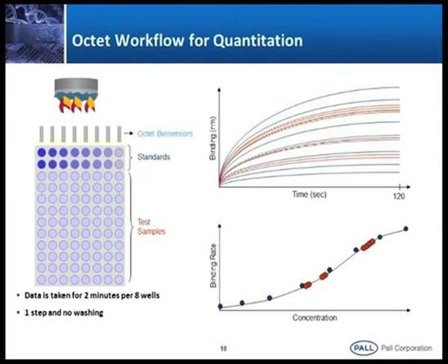How exactly does it work? For a quantitation purpose, I am dipping 8 sensors here. You can see we generate different concentrations here, say from 100 microgram per ml, with 2-fold dilution. If I go with 8 concentrations we can determine, 8 samples read at a time. Think about if you are performing a UV based one sample, how much time it will take for a reading. For roughly 8 concentrations or 6 data points, half an hour. Each time you have to wash the cuvette and then put in the next concentration.